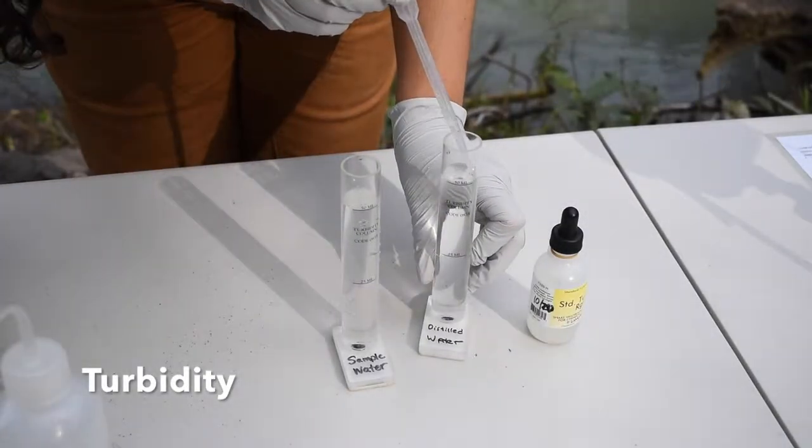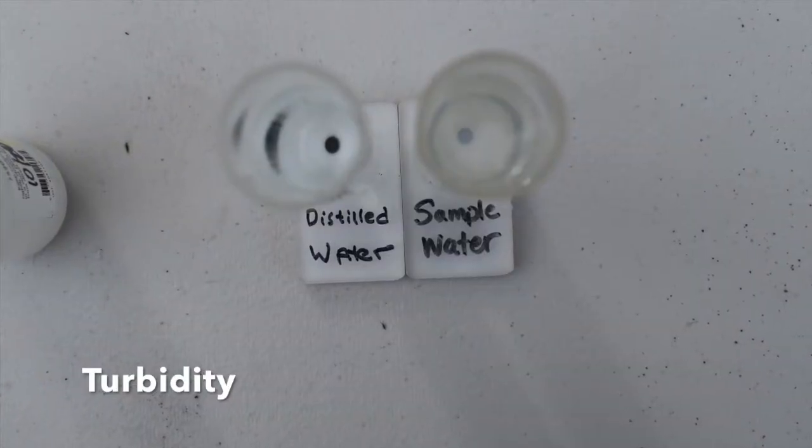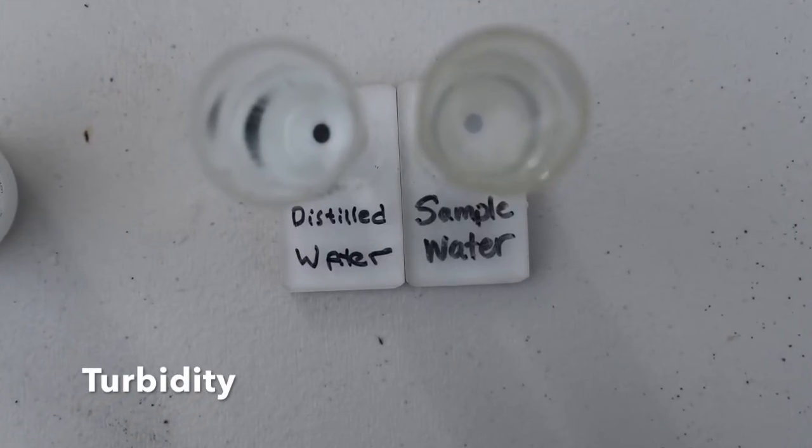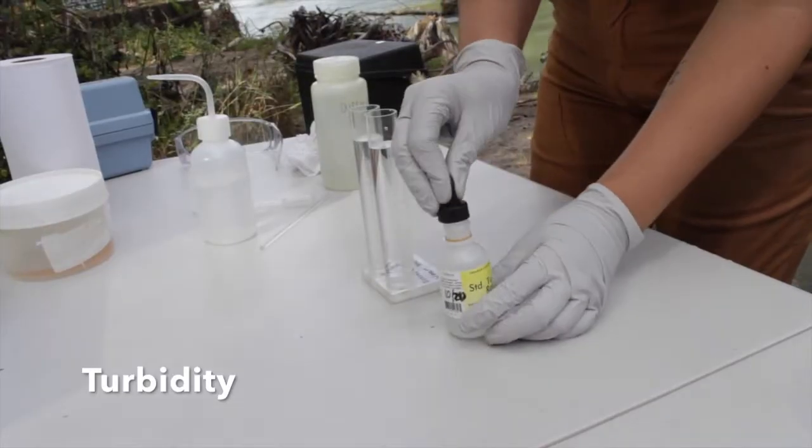When looking down the tubes vertically, we can clearly see the dot at the bottom of the tube better in the distilled water than in the sample water.